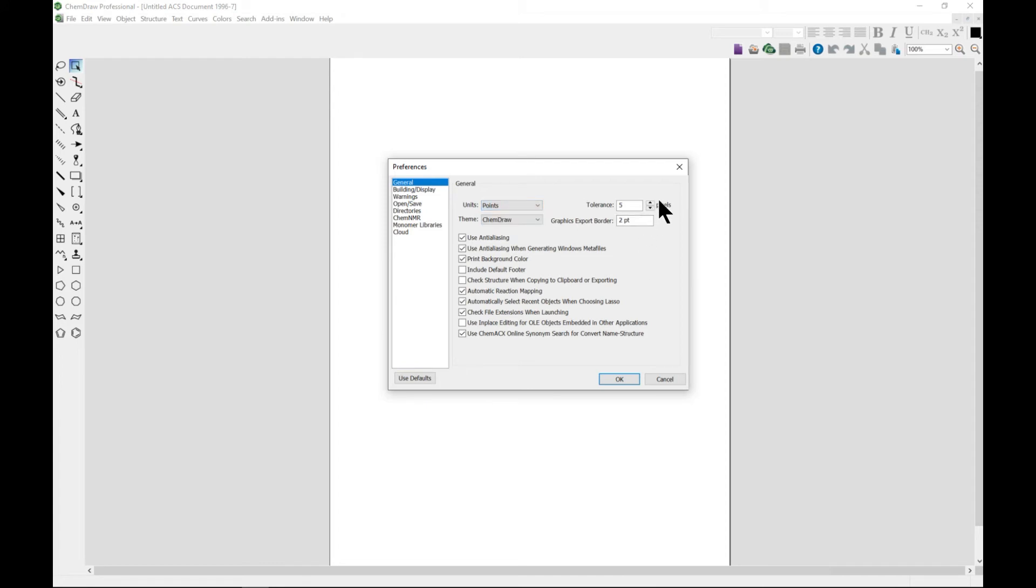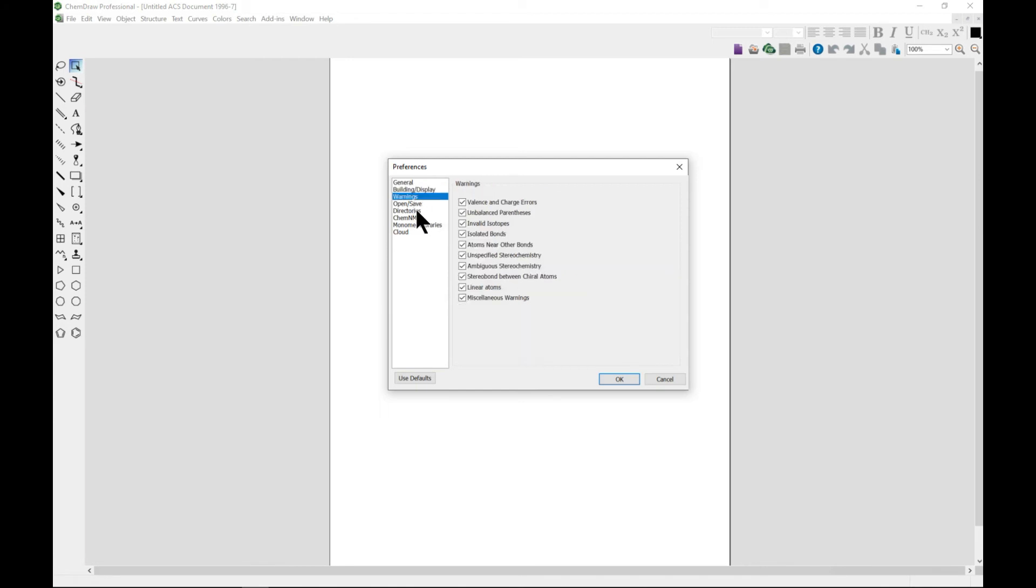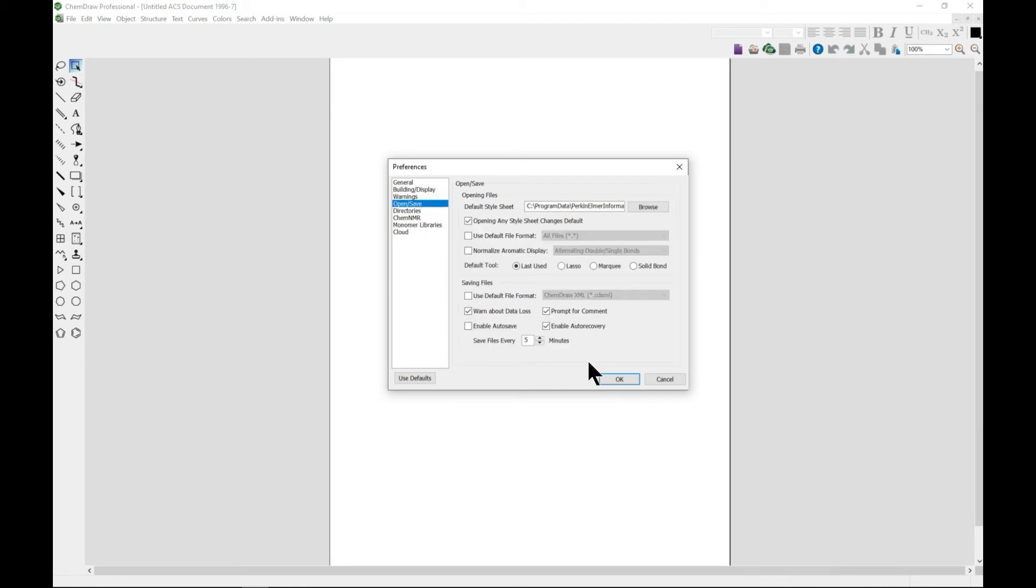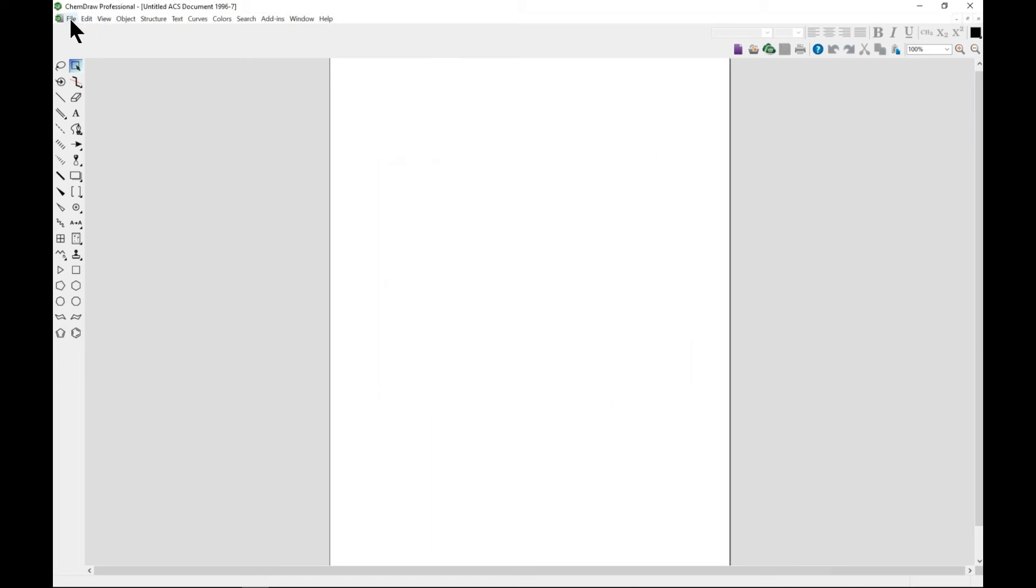You can also add tolerances. Preferences is also something very useful and will help you customize your interface. You can add warnings - I think you should leave everything checked. Open and Save is also important - you can enable auto save, enable auto recovery, change the time and all that.